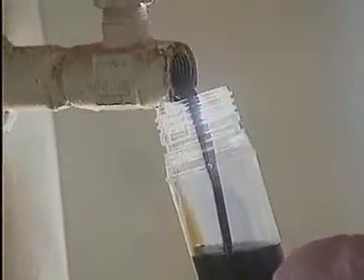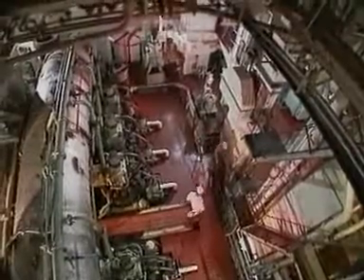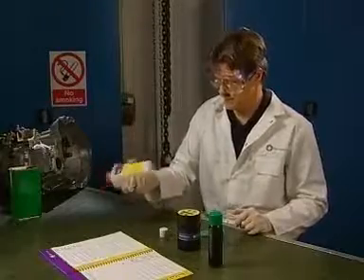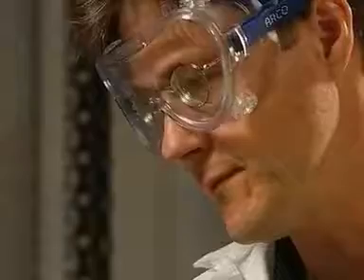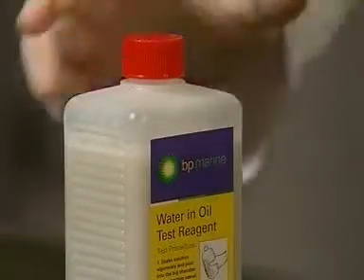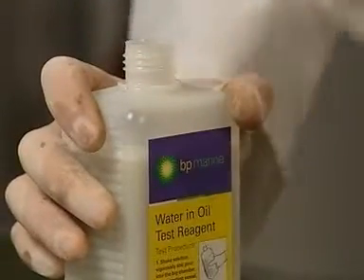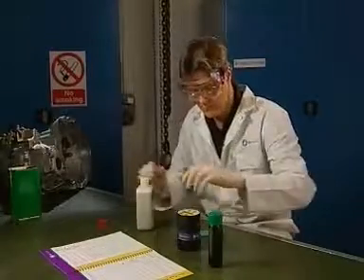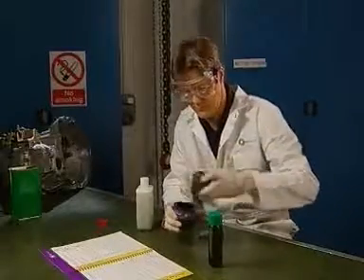Draw a representative sample of used lubricating or hydraulic oil. Shake the water in oil test reagent vigorously. Change the lid to the pouring cap. Open the twin check reaction vessel.